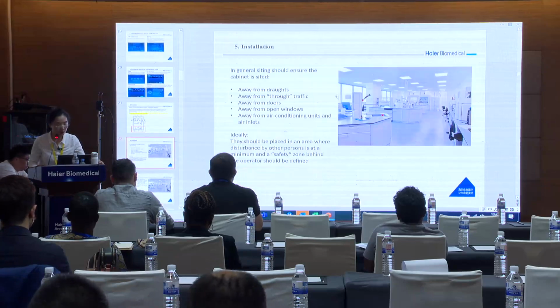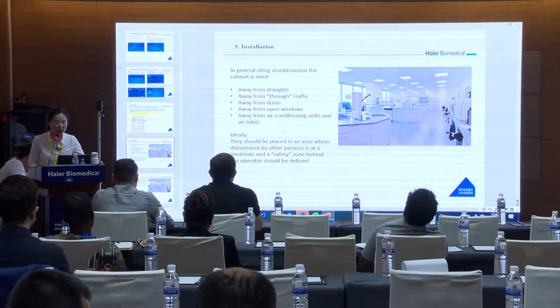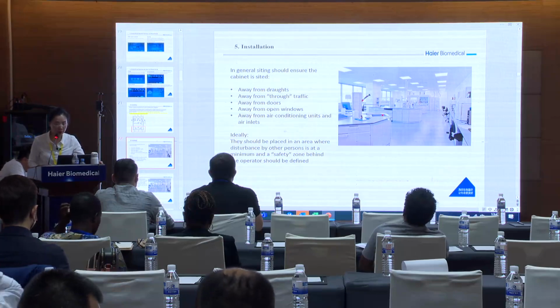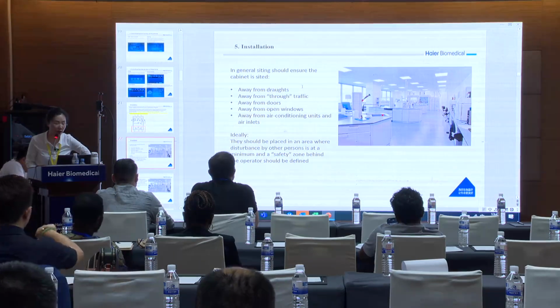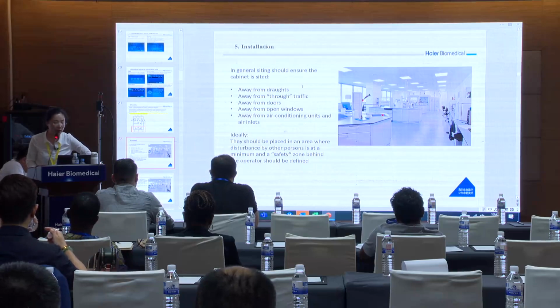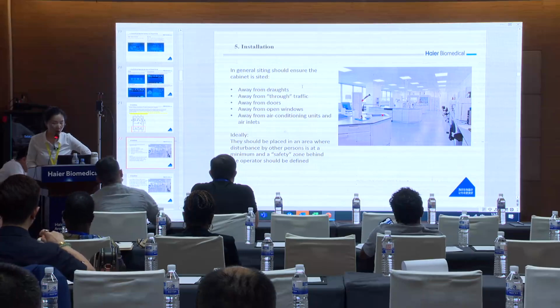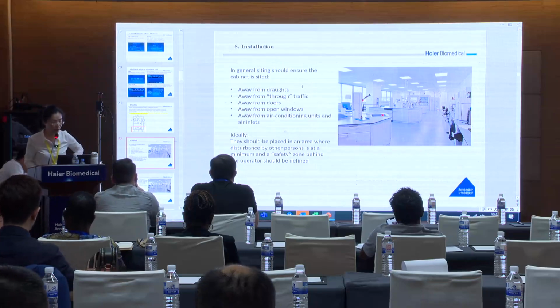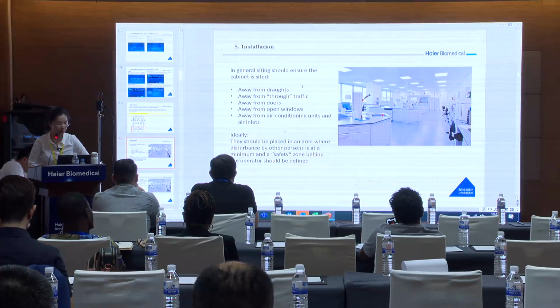Now I introduce our installation. You can see this picture is a laboratory picture. In general setting, there are 5 important points to ensure. Firstly, away from through traffic, away from doors, away from open windows, and away from air conditioning units and air inlets.